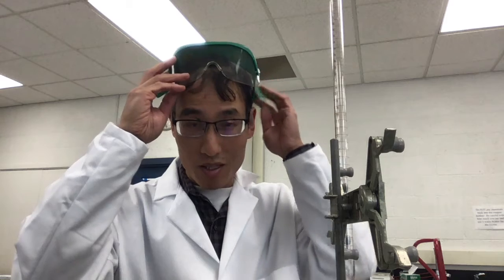So the basis of titration is you have one thing that's known and you have one thing that's unknown. I'm just going to raise my glasses for a second. And you're going to use the thing that's known to figure out either the moles or the concentration of the thing that is unknown. So this is a Buret, this thing right here.